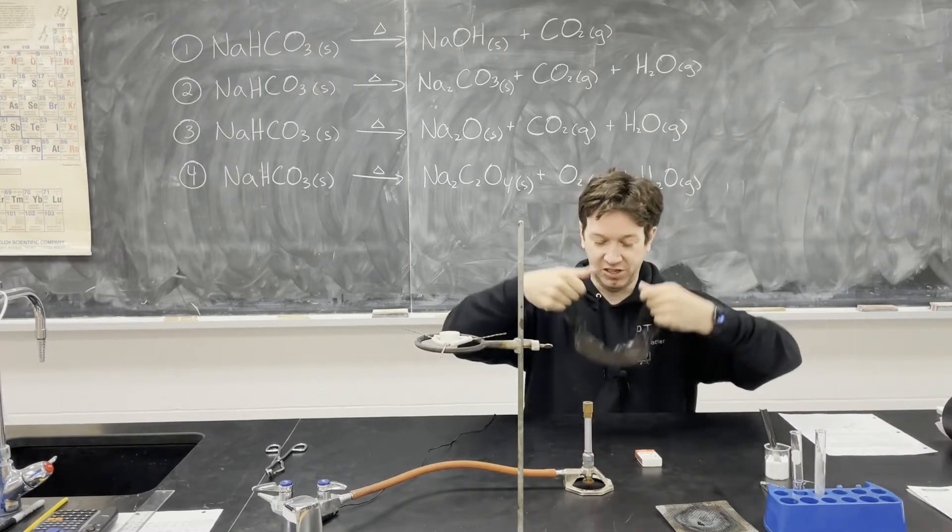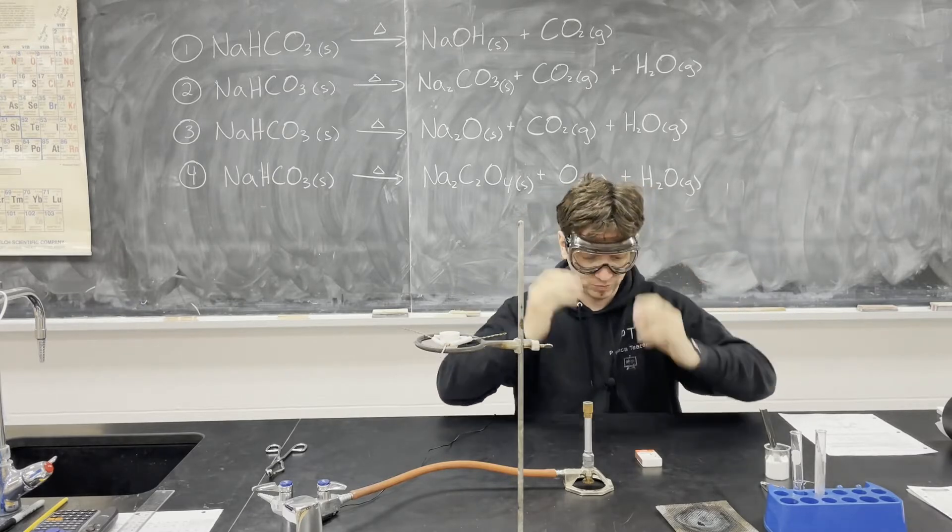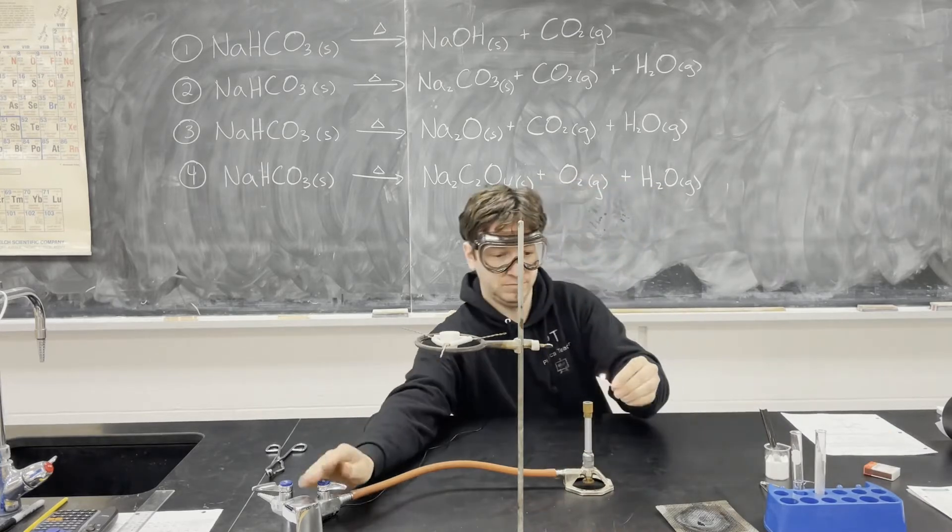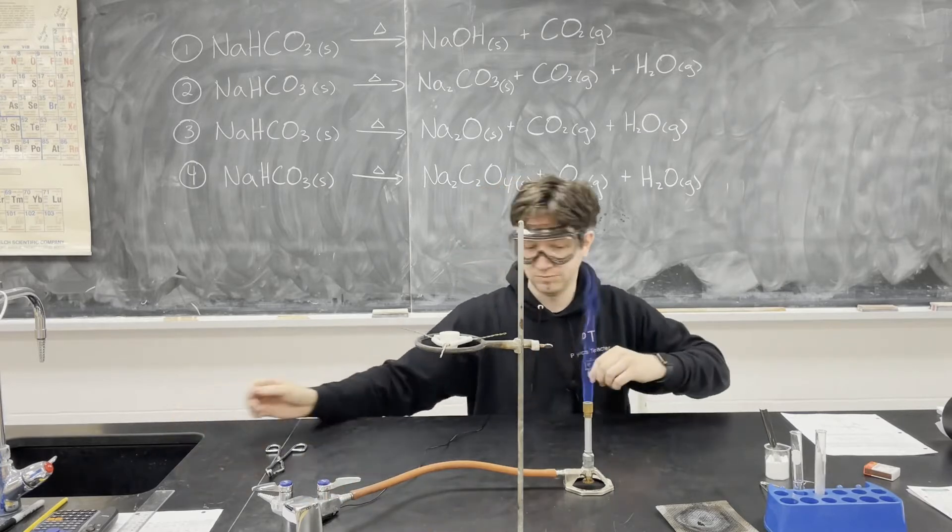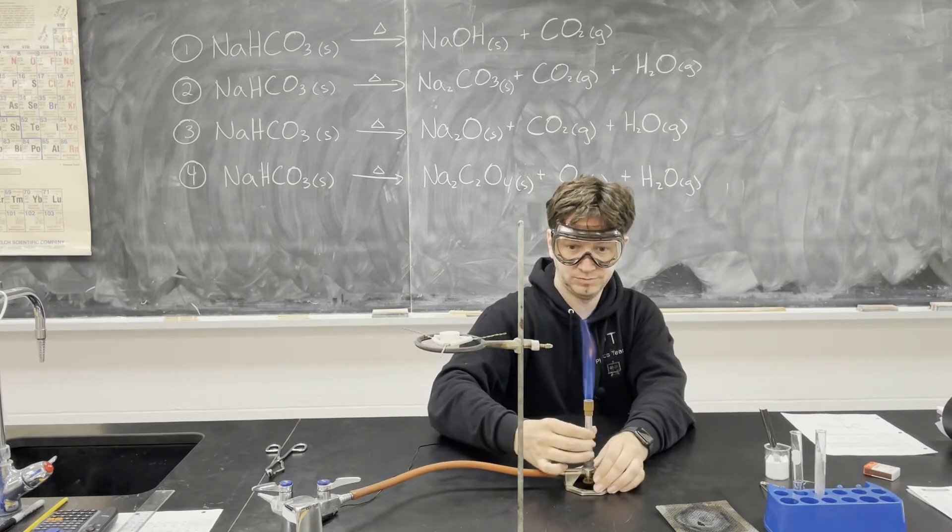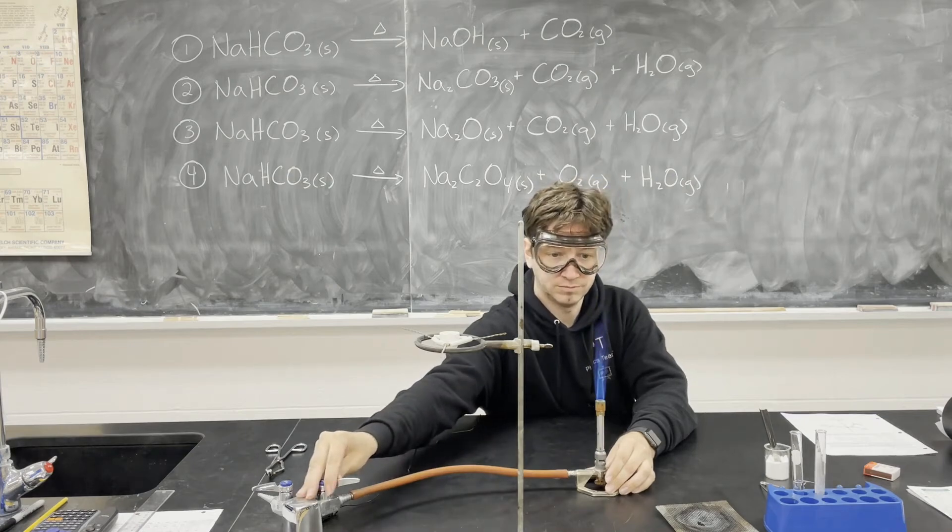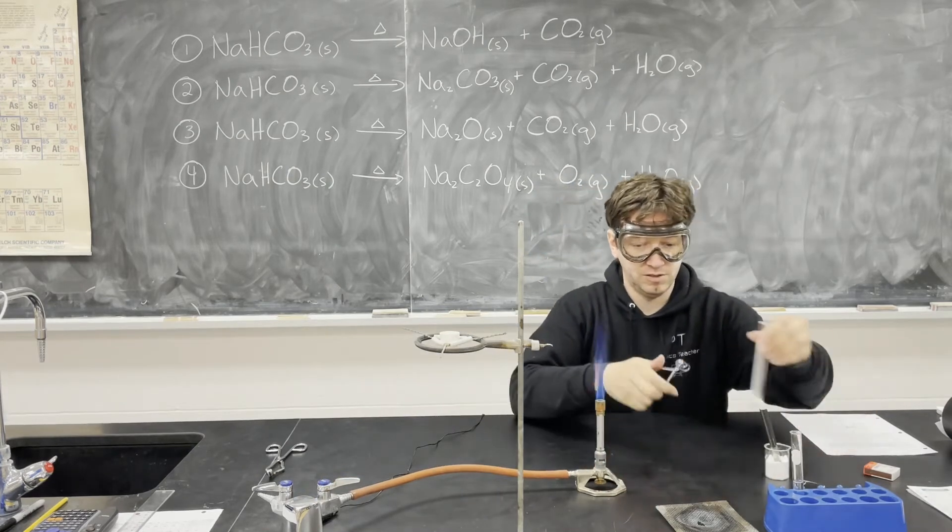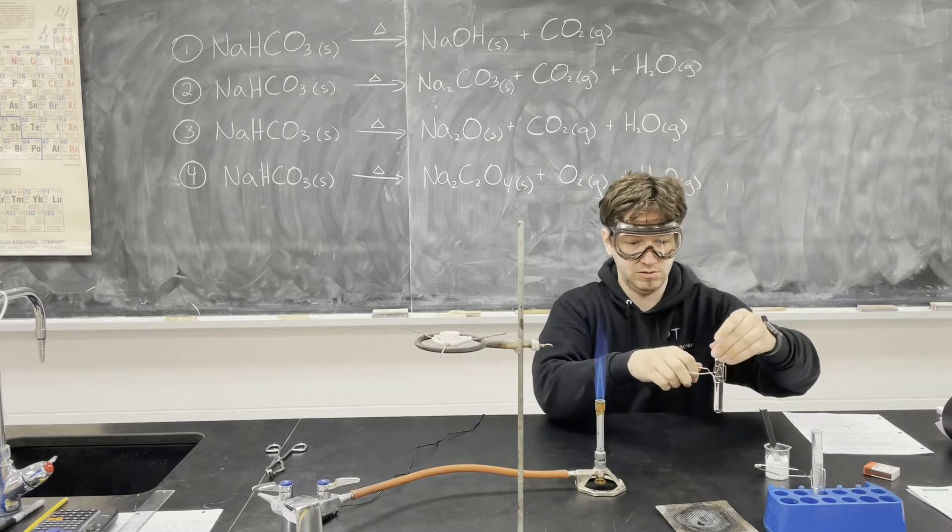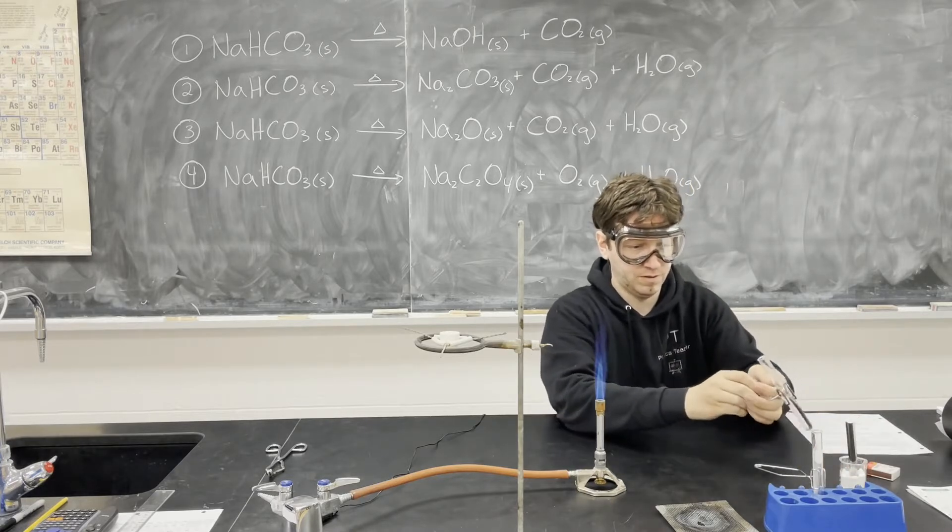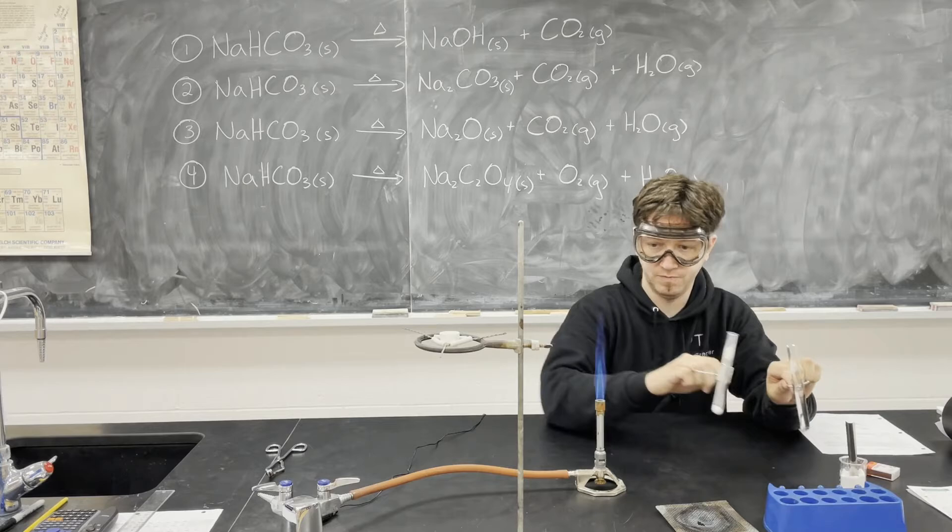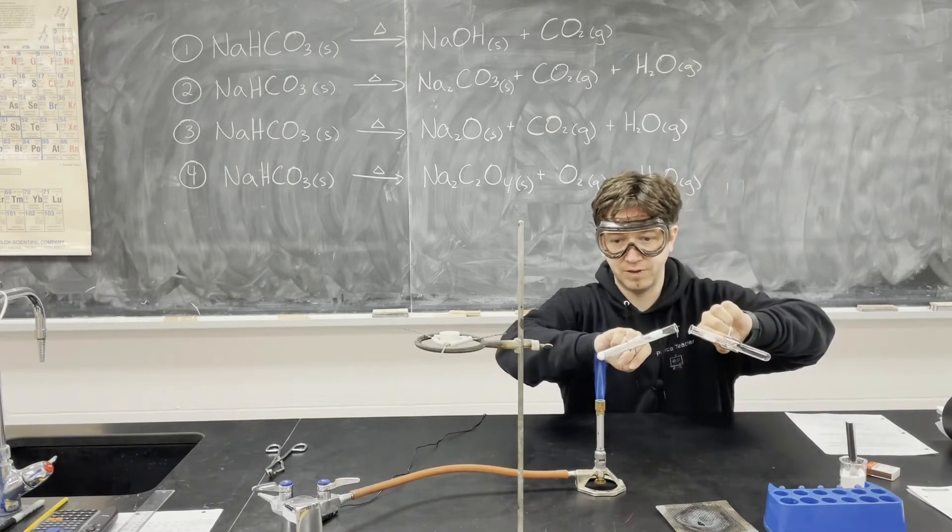I'm going to put on our safety goggles. Light our Bunsen burner. Here we go. And start heating.